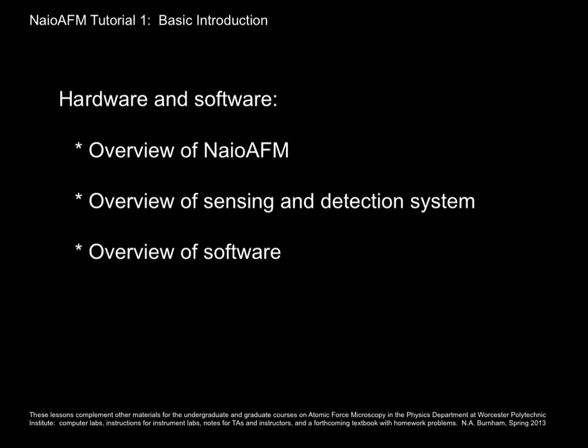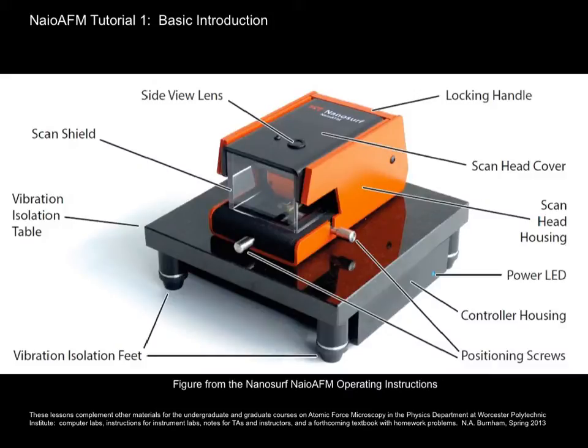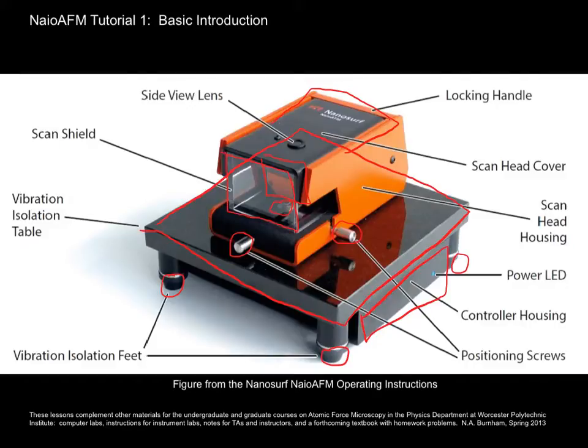Now I'll give you an overview of the instrument itself, its sensing and detection system, and the software. It sits on a granite vibration isolation table with vibration isolation feet. The electronics are all just underneath this tiny unit. The scan head, the active part, is right here. The sample goes here, and you can position the sample underneath the cantilever tip using these two screws. This locking handle holds everything steady in place during imaging, and you open it up to exchange either the sample or the probe. This part here is the scan shield, which prevents air currents from disturbing the measurement.